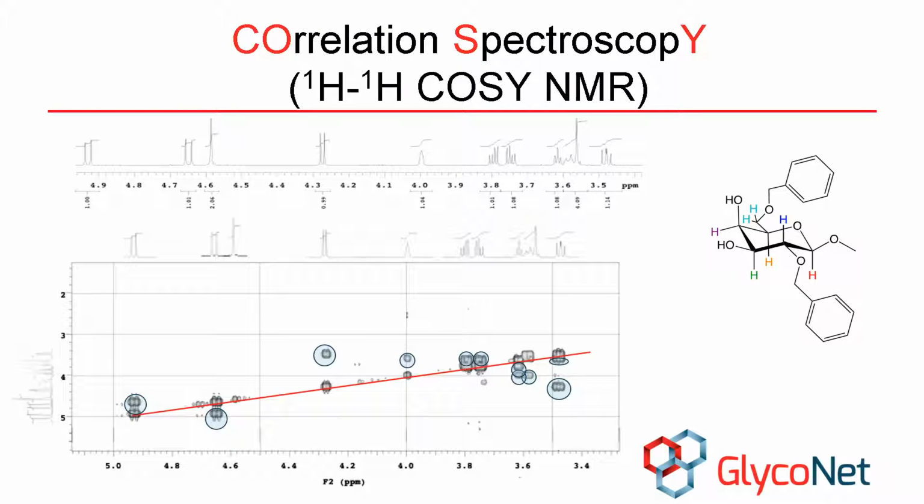When interpreting the COSY spectrum, we are most interested in the cross peaks, as these peaks will typically give us information about which protons are interacting with one another up to 3 chemical bonds away from one another. To read a COSY spectrum, find a peak along the x-axis and draw a dashed line vertically. All of the cross peaks along that vertical line are protons that are coupled to your peak of interest.